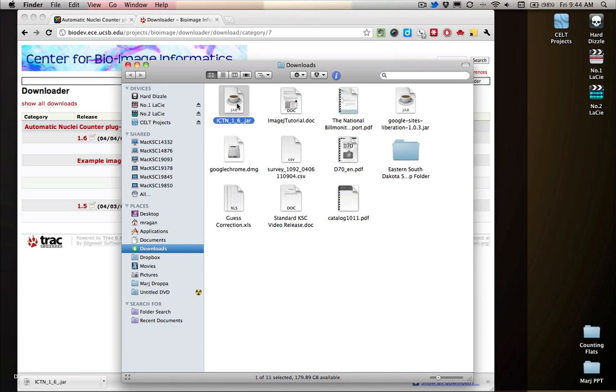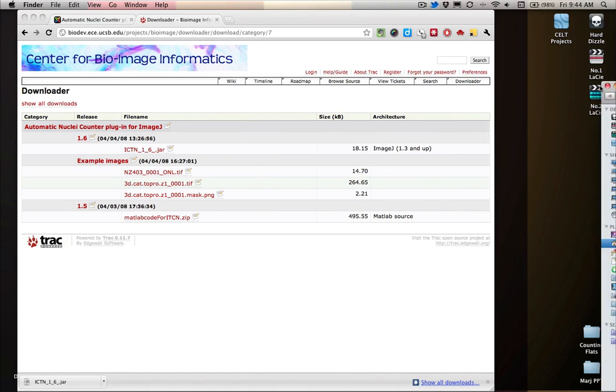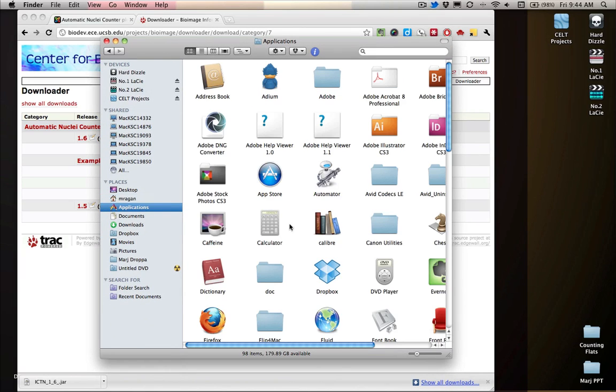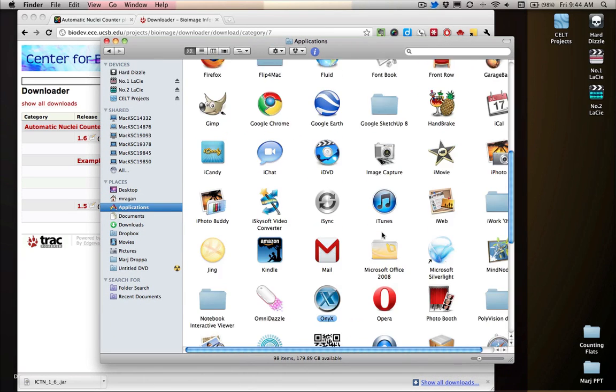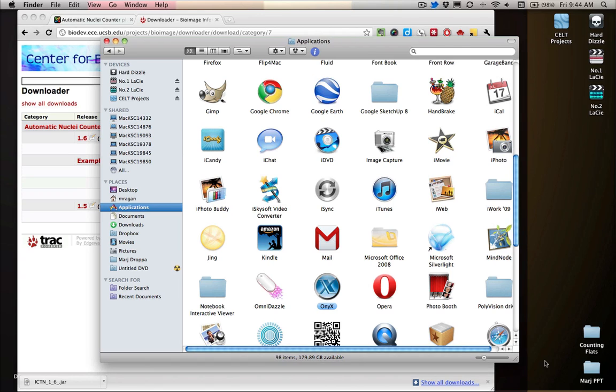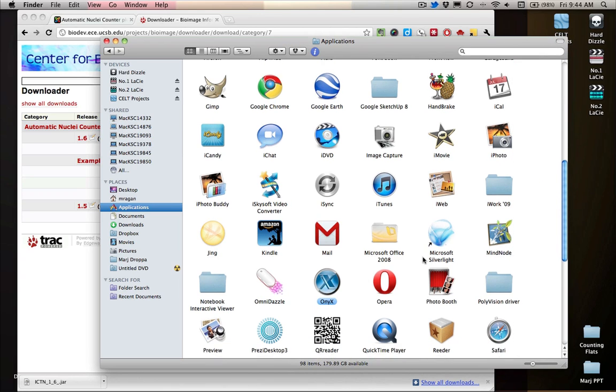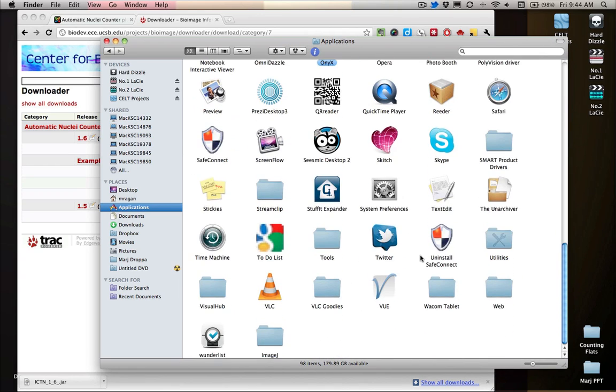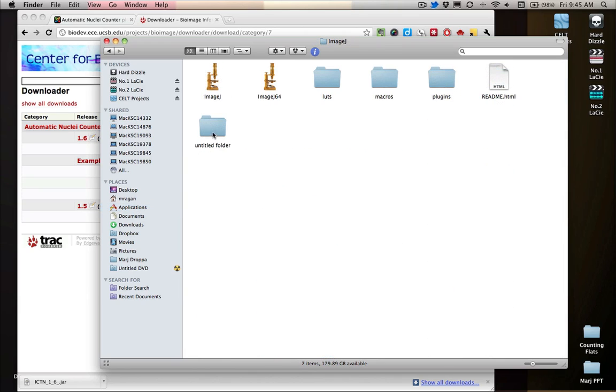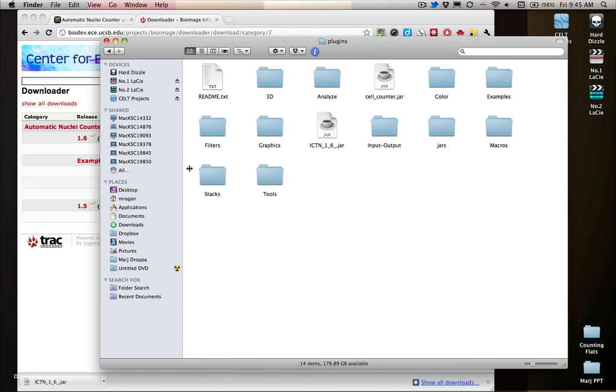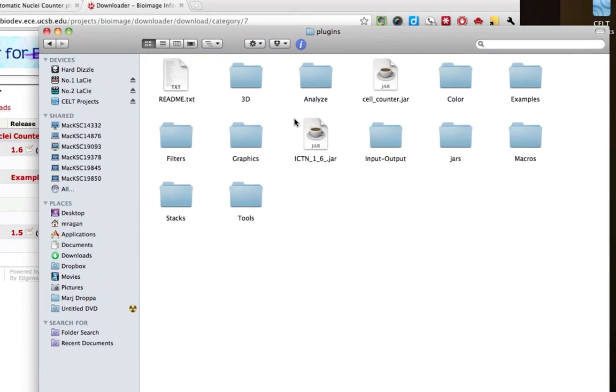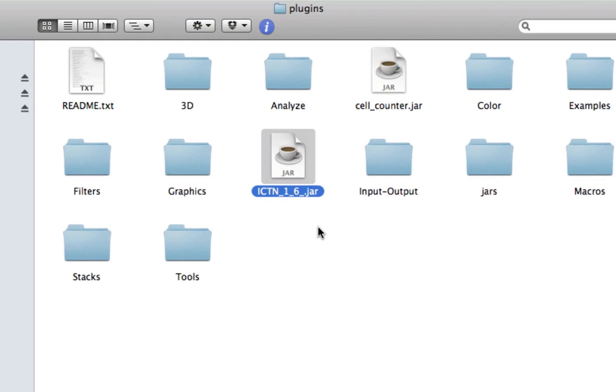And so then you just have to take this file and put it inside of the plugins folder for ImageJ. If you're working on a Mac, then you just have to find the folder for ImageJ. So then inside of this, we just jump into our plugins folder and then we drag that file right into here. You can see that I've already dragged in my little ITCN file.